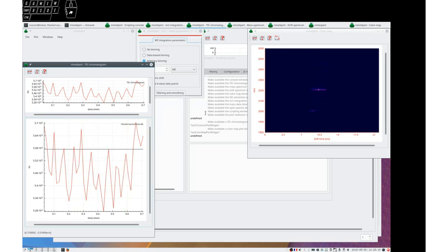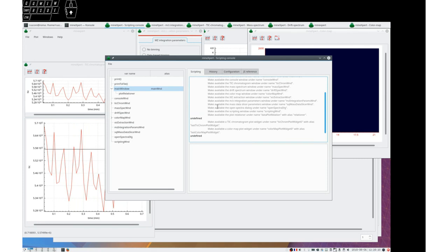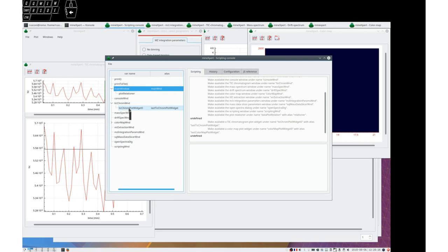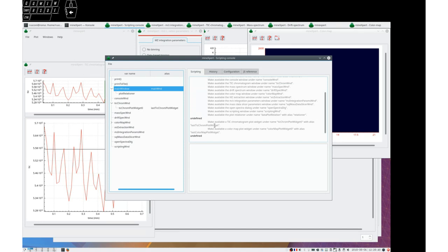And now look that a new item has been added here and there is an explanation here. Make available a tick chromatogram plot widget under name tick chromatogram with an alias last tick chromatogram.